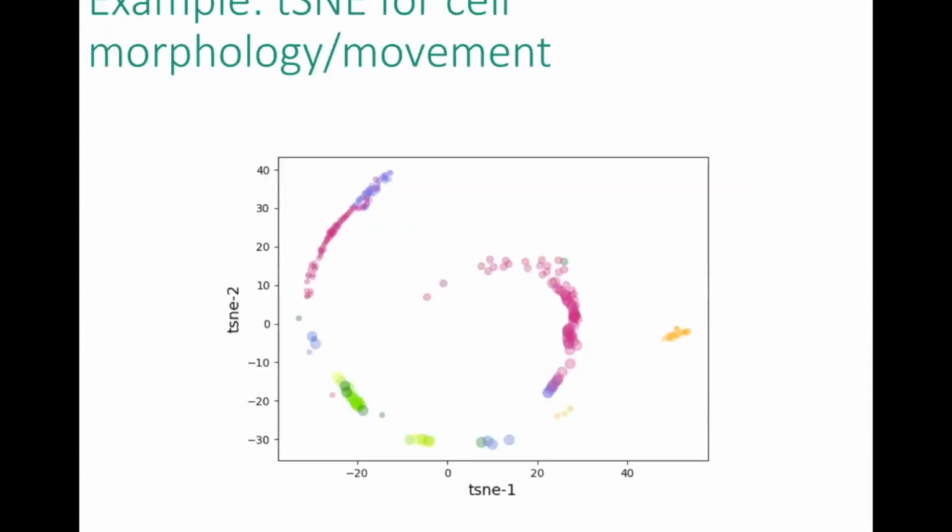So at the beginning, I mentioned that we wanted to connect cell morphology with cell movement. So taking a few of those hyper accurately segmented movies, we did a basic t-SNE plot, so dimensionality reduction of the cell morphology. We looked at things like area, ratio of area to perimeter, if you put an ellipse there, what angle the major axis is at, stuff like that. These were our features for our t-distributed stochastic neighbor embedding. And these colors are the different classes, so this is what direction the cells are moving in. And we can see that we're kind of separating out the different directions.